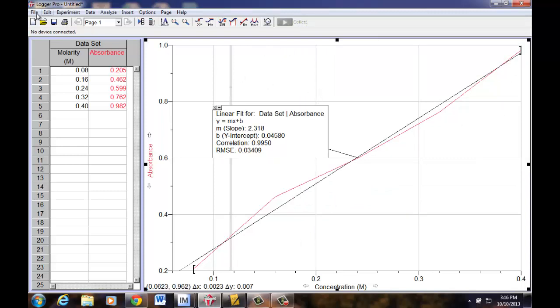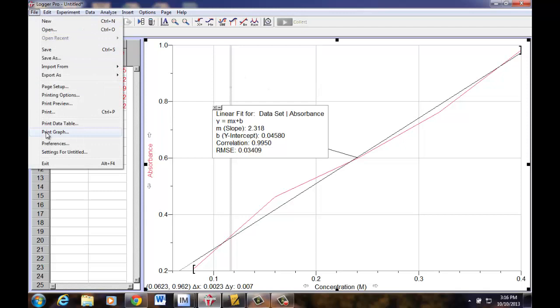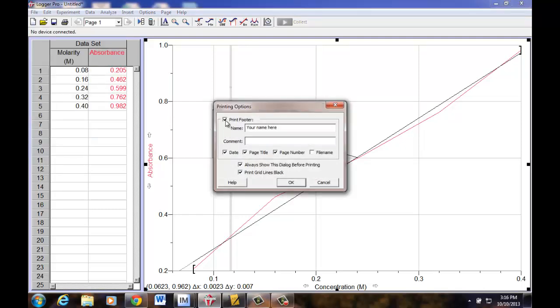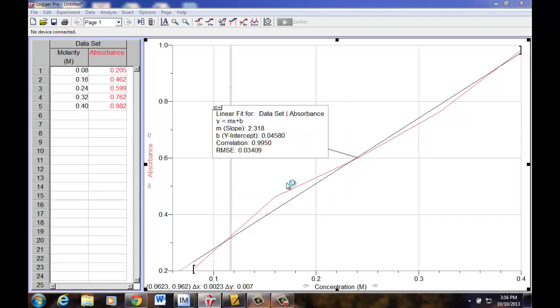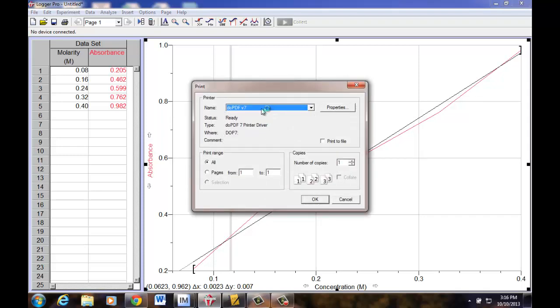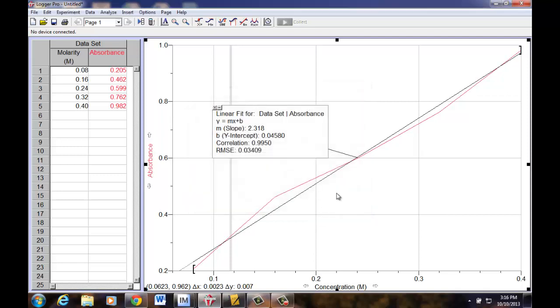But now that I see I have a nice looking graph, this is what we're asked to print. So now what we would do is print the graph. And you can print the data table separately, but really all I need to see is the graph. And at this point, I want you to put a footer here. And all we would do is type your name and call this Beer's Law, and that way you can have a footer appear when you go to print. You'd have to select the printer that makes sense for you and then just hit OK, and then it will eventually go to your printer. And this is now, for number one, all set.